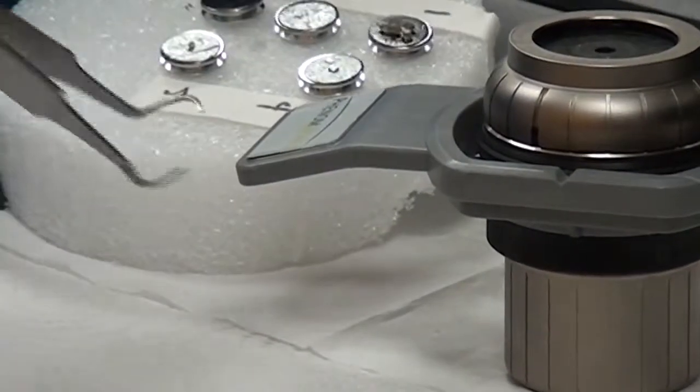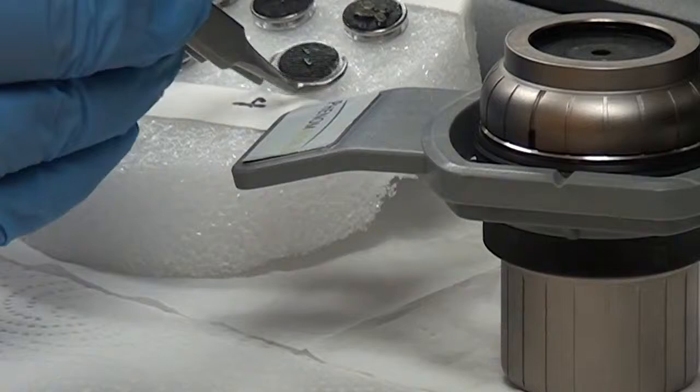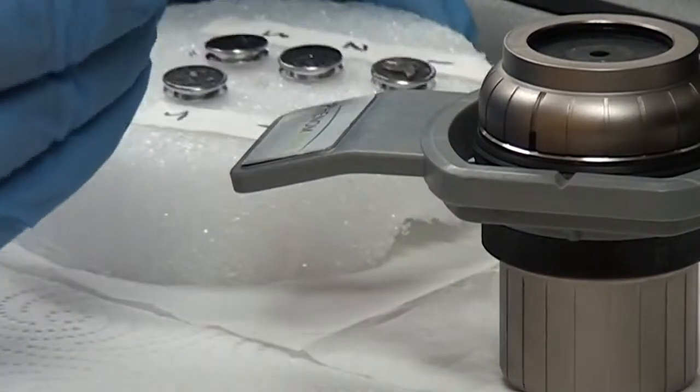Now the stub is mounted on the sample holder using the special tweezers. This is the calcium carbonate sample.